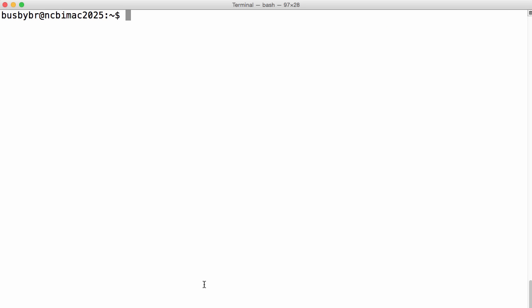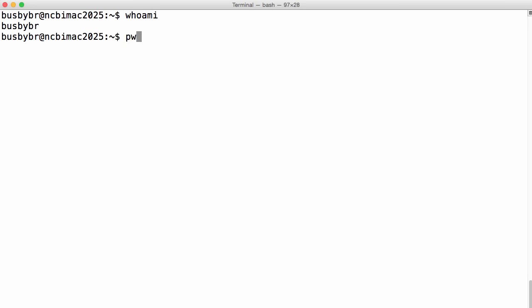Here I am on a command line on the Mac. There are many ways to get into the command line and some popular ones are outlined in the handout for the DNA Seq section. The first command I like to use is 'whoami' — this tells me my username on whatever system I am. Another question I can ask is 'pwd' — this will tell me where on the system I am.